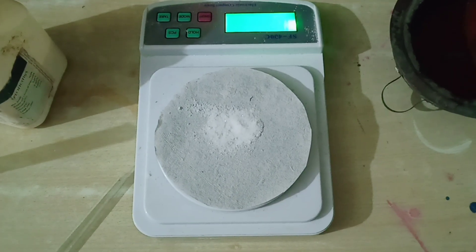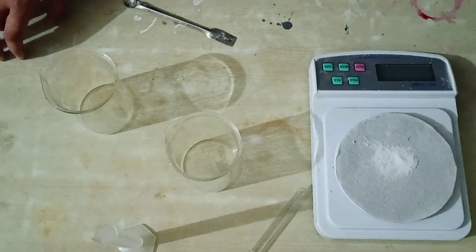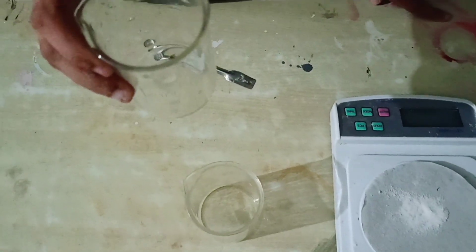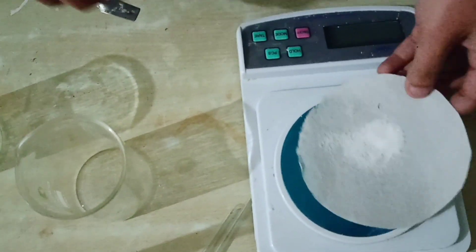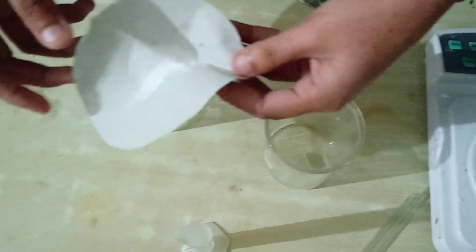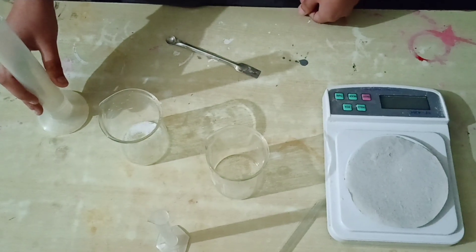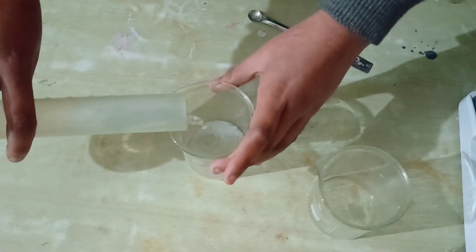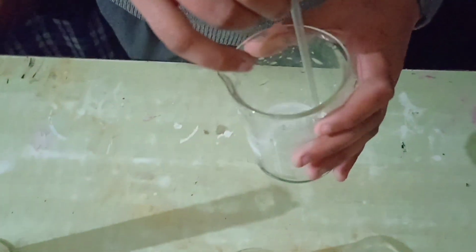Procedure. First of all, we will measure 2.5 grams of potassium sulphate. Now we will take a 250 ml beaker. In this beaker we will take 2.5 grams of potassium sulphate with 20 ml of distilled water. Now we will mix it thoroughly with a glass rod.